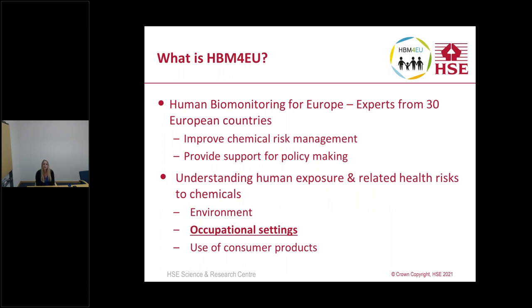Okay, so the HBM4EU program consists of experts from over 30 European countries, and their aims are to improve chemical risk management and provide support for policy making and risk assessment. And they are going to do that by understanding human exposure and related health risks to chemicals, either in the environment, by occupational settings, or by the use of consumer products. So the work strand that we're involved in is investigating workers' exposure to hazardous chemicals in the workplace. One of the important focuses of the HBM4EU project is to harmonise methodologies and standardise approaches to data collection to enable the comparisons and the findings of the results across all the different European countries.